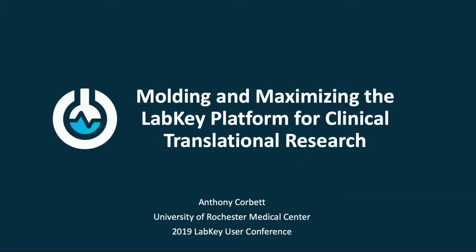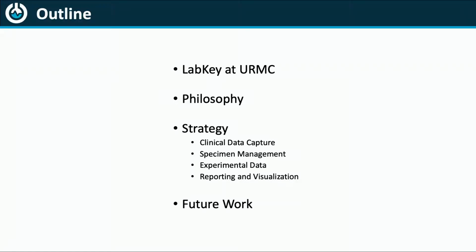And we are a service organization for researchers to provide data management and analytical services for their research studies. So I'm going to go over LabKey at URMC, a little bit of philosophy. This is how we implement LabKey in the projects and solutions. And then I'm going to give a generic overview of strategies that we've been using to implement a data management solution in our context. This includes clinical data capture, specimen management, and then integrating experimental data. And finally, what the PIs really want are the reporting and analytics. And I'll touch on future work.